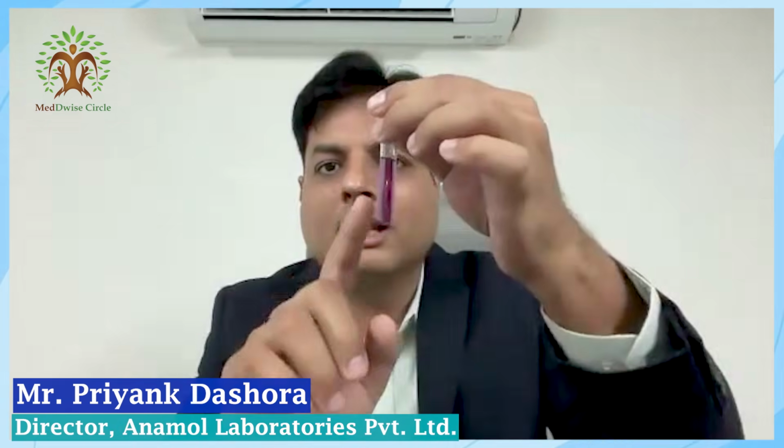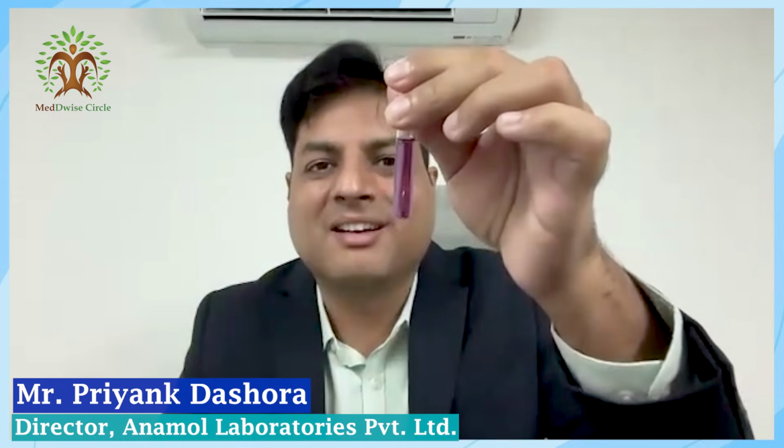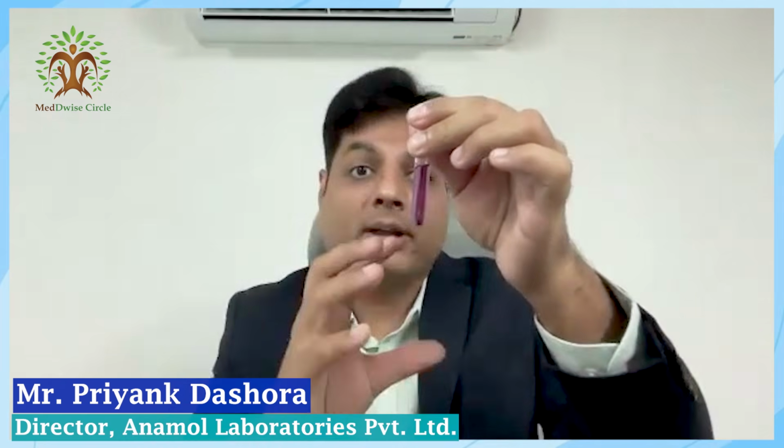If the human serum had a very small amount of glucose, the color will be light. But if the patient sample had a very high concentration of glucose, then the color which will be formed will be very, very dark. So if the color formed by the reaction mixture is very dark, it will absorb more light.